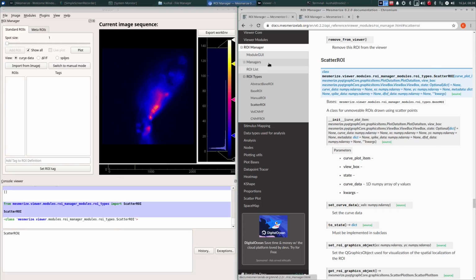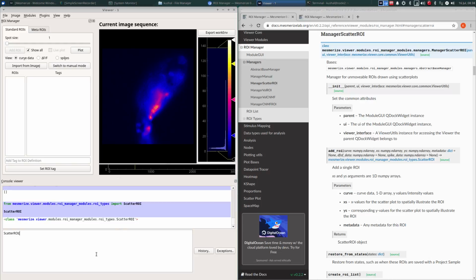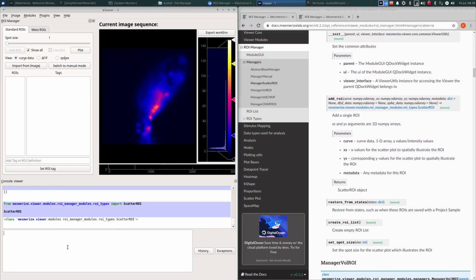Actually, there is a simpler method for doing this. Sorry, I did not script this video tutorial ahead. We can just directly use the manager scatter ROI backend to add ROIs. Yes, sorry, this part was not necessary. So let's create a new ROI.